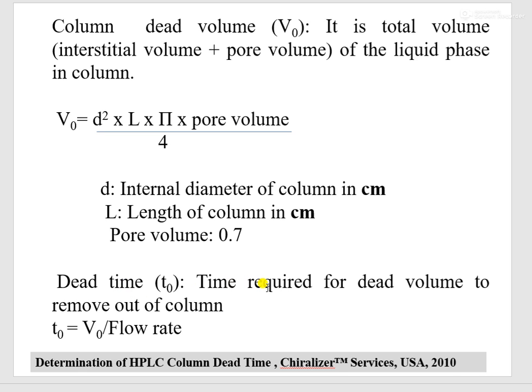Dead time is the time required for the dead volume to come out of the column, and the formula is T0 is equal to V0 upon flow rate. So as flow rate increases, the dead time will decrease.